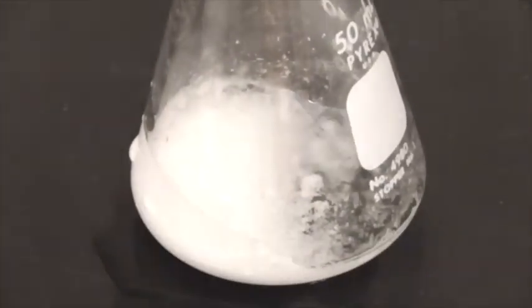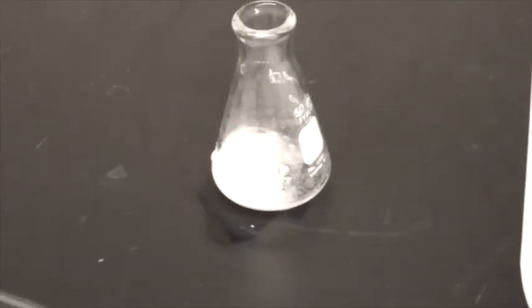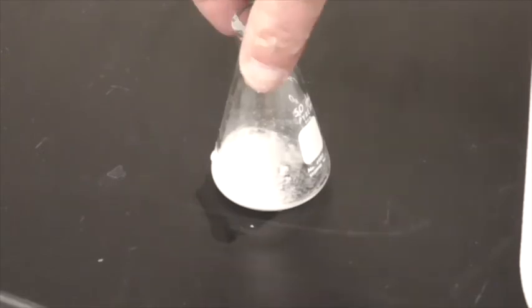Okay, so what we need to do now is, it says to add 20 milliliters of water. So I am going to put a beaker of water in the ice bath, because I want to cool down that water. I'm going to let that cool, and then we will add 20 milliliters of that cold water to our sample. While that water is cooling, I'm actually going to throw our flask back in the ice bath also to keep everything cold.